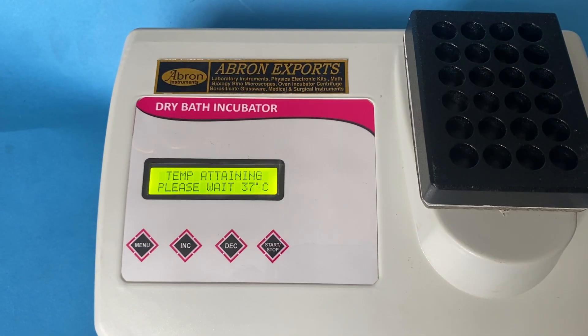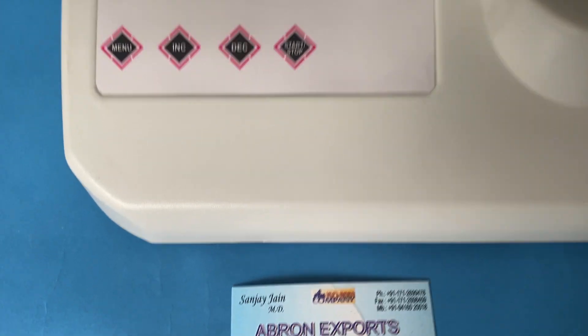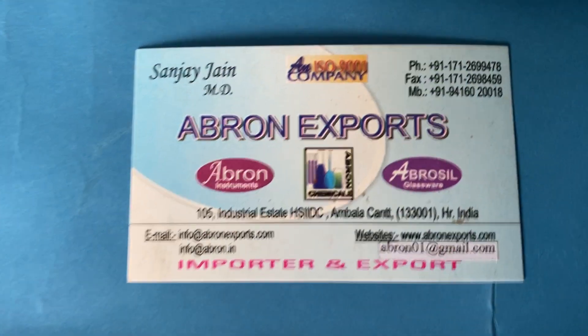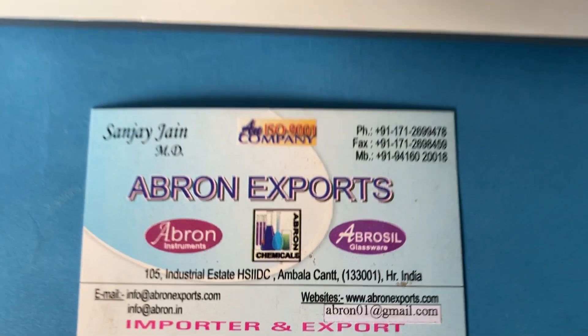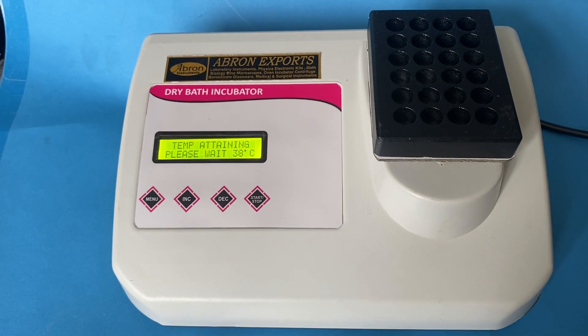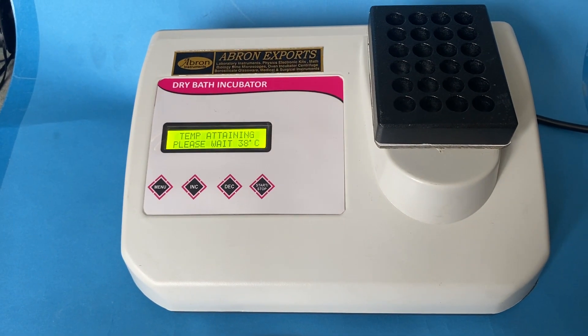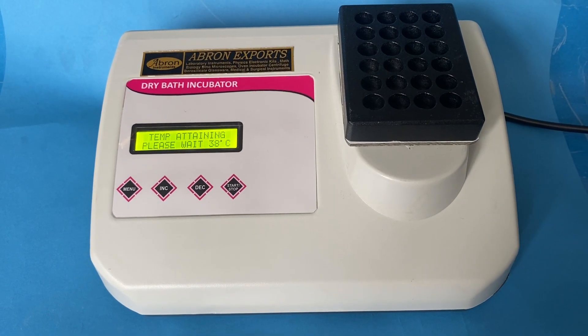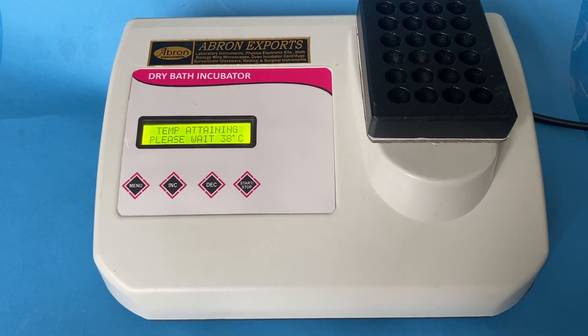Very easy to operate, very easy to use. Please visit AperonXports.com and send us an email at Aperon01@gmail.com. This is a very easy instrument — a graphical version is also available. Please visit the website, share the videos, and write to us with any questions. Thank you very much.